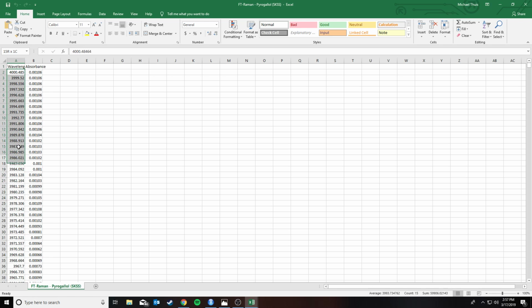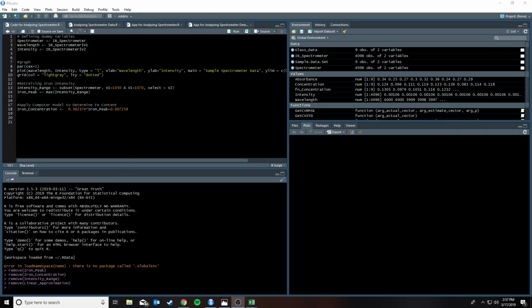The wavelength range that we're probably going to look at and run for these tests is going to be a lot more narrow than this. It's probably not going to be this large of a data set, but this is good for testing the model and making sure that it works for any sort of situation. So with that in mind, this is the data set you expect for an IR, and this is how we're going to analyze it.